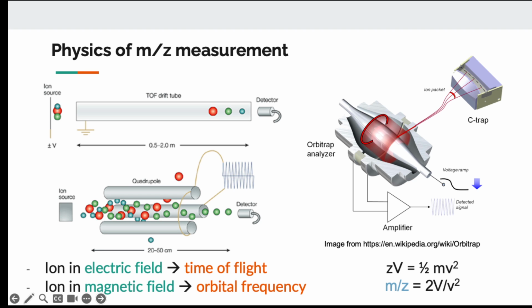In some other mass spectrometers, called Orbitrap analyzers, orbit here means orbit. Orbit is when you have some molecule or some object that travels in a circle around another object. So in this case, we are going to accelerate the peptide or protein ions with a magnetic field. And it's going to travel inside the mass spectrometer in orbital motion, in circular motion.